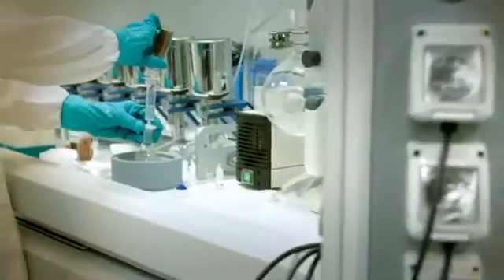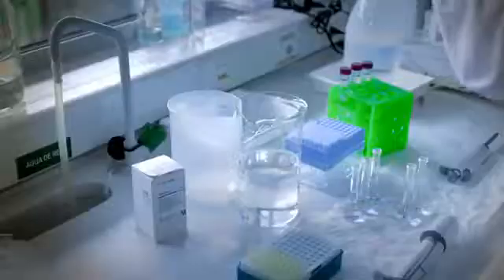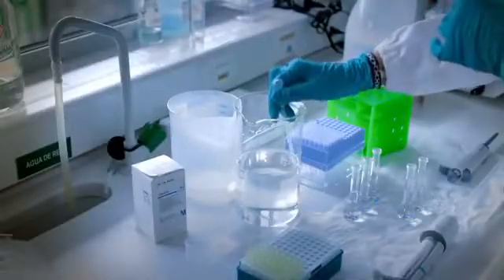So what makes the Tarragona facility unique is the ability for us to do R&D experiments, doing exactly what our customers do in the volumes of water that they treat. So this allows us to scale things very quickly from R&D experiments to full-scale industrial experiments.